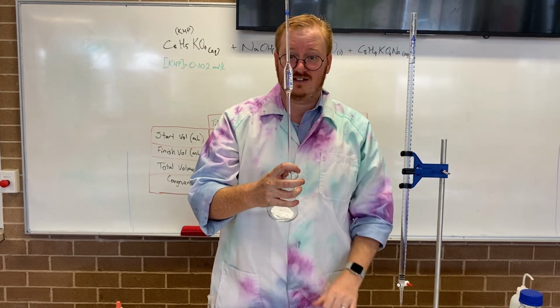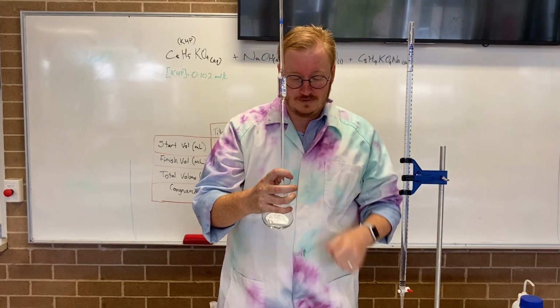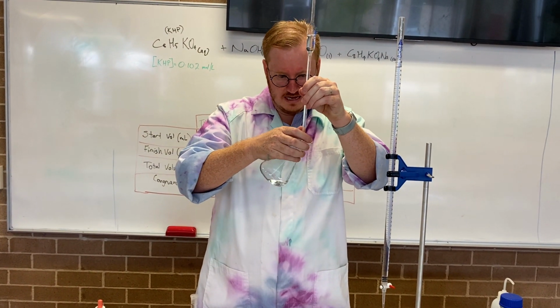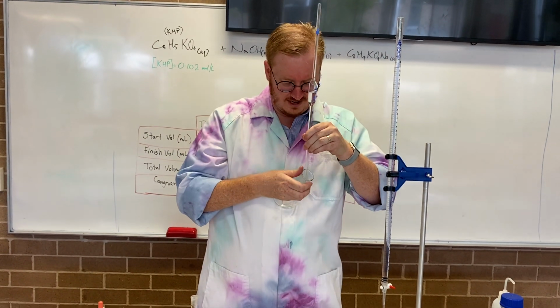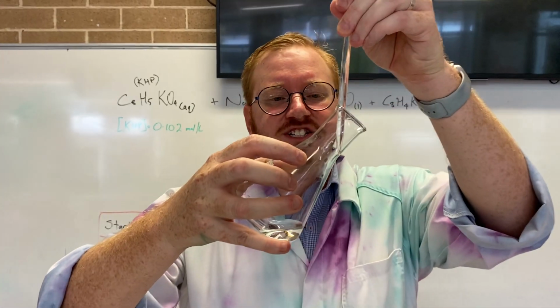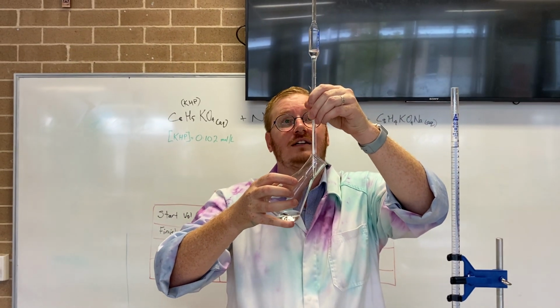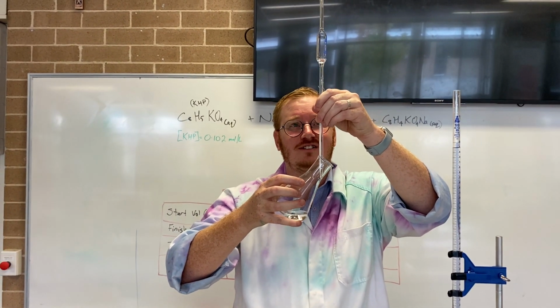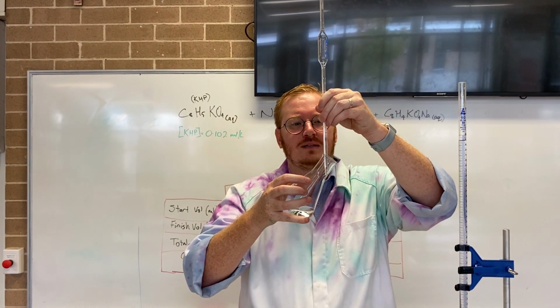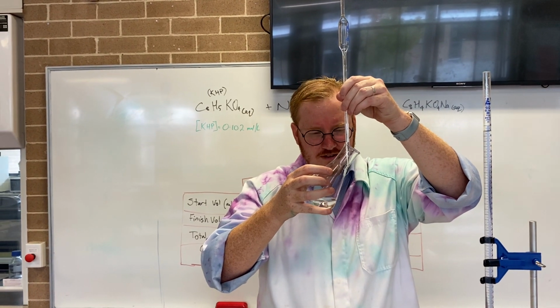Got a bit of water in, that's okay. I know I'm delivering a certain number of moles of KHP here. I'm gonna leave it at an angle. The glass, trying to get it into position where you can see, there we go, that's a bit better. The glass is touching glass. The glass is drawing down the liquid from there by capillary action. And there will be a touch left in the tip, but the pipette is designed to counter for that volume.